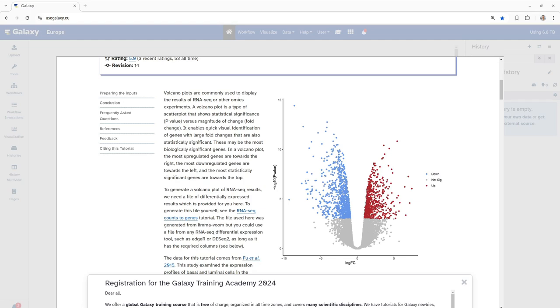So without further ado, let's begin exploring the data and see how we can use volcano plots to gain insight into gene expression during these key stages of mammary gland development.